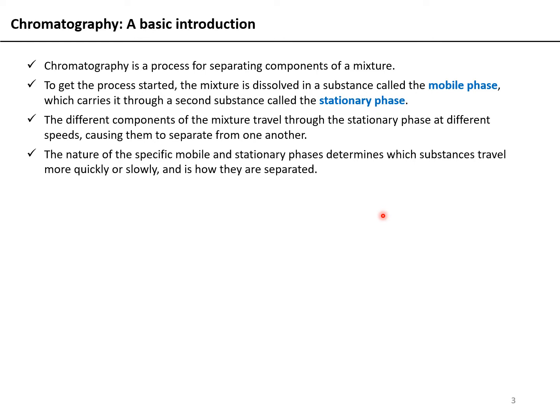But for now, let it suffice to know that you have the stationary phase, which is your beads packed into a column, and you have the mobile phase, which is your load or the lysate which you have clarified. When you add this mobile phase onto the stationary phase, different protein components migrate at different rates.